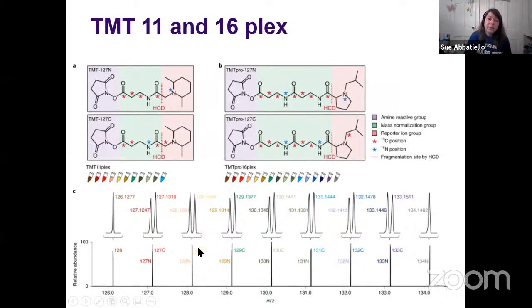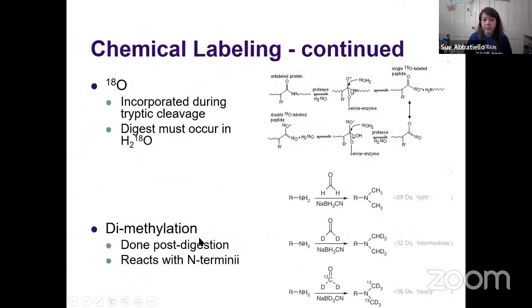The importance of this is being able to measure your samples enough times to determine their biological variability and the technical variability in the measurements. This allows you to tease apart what's being changed due to biology versus what's being changed due to just measurement precision.